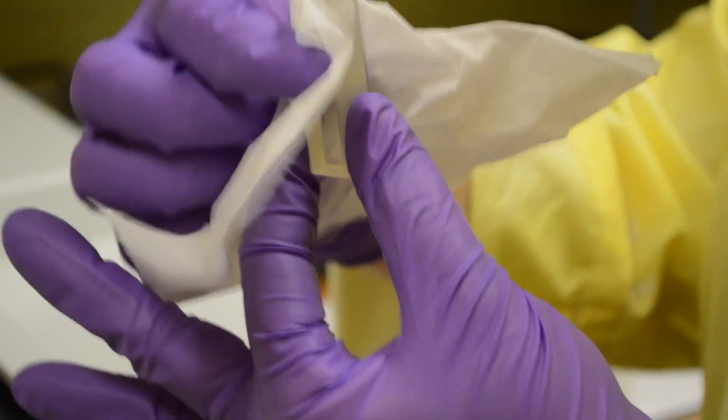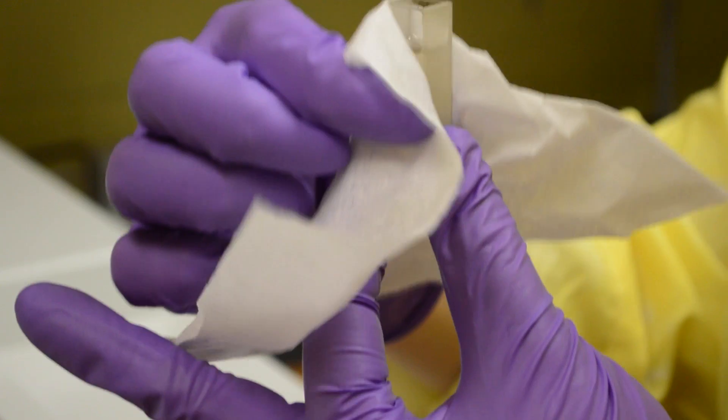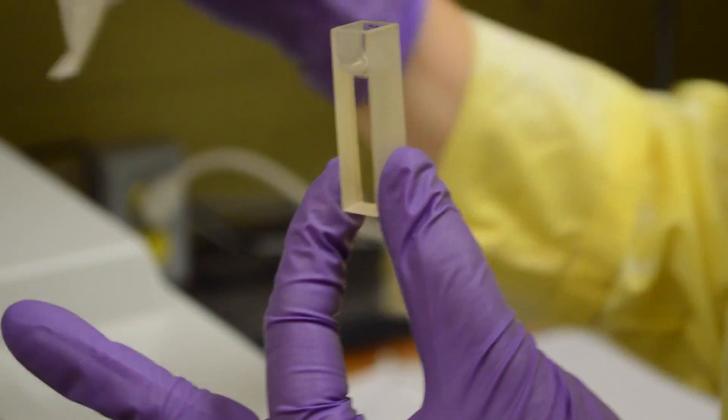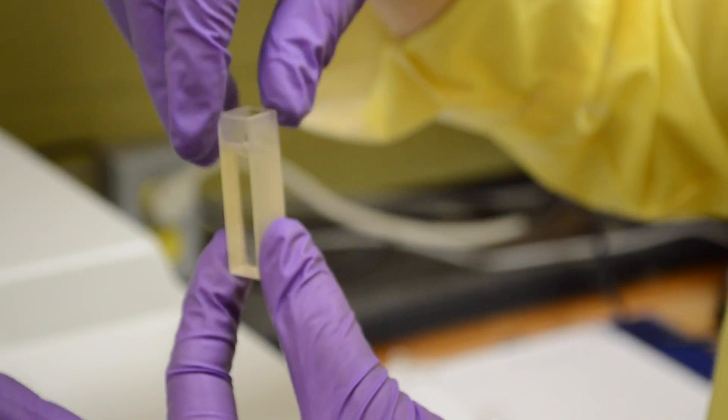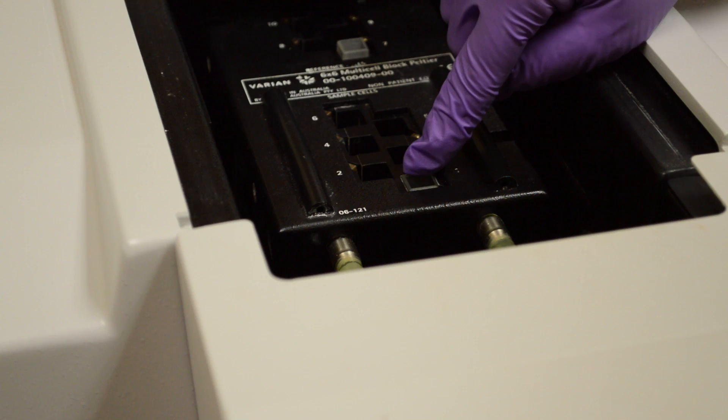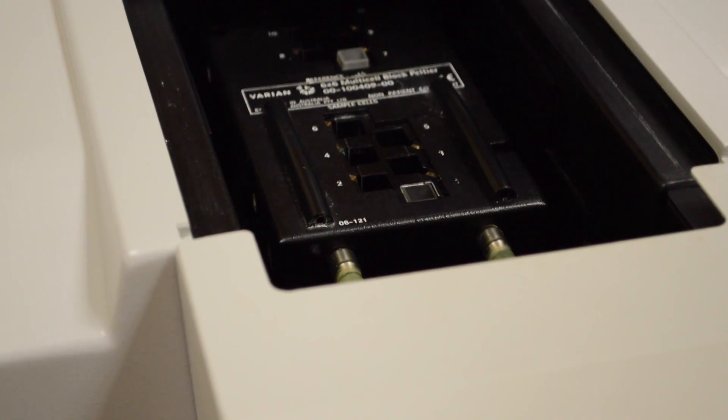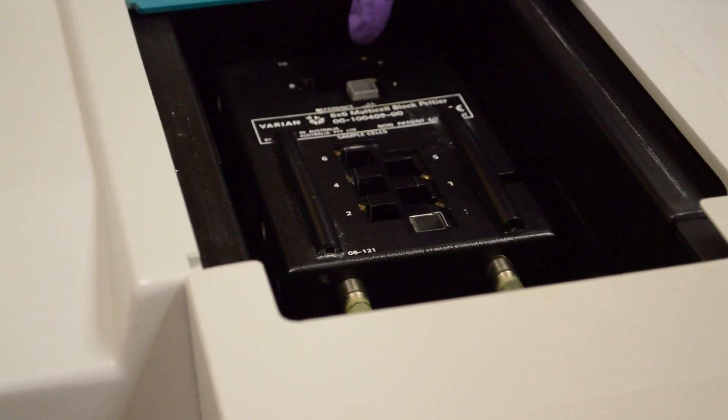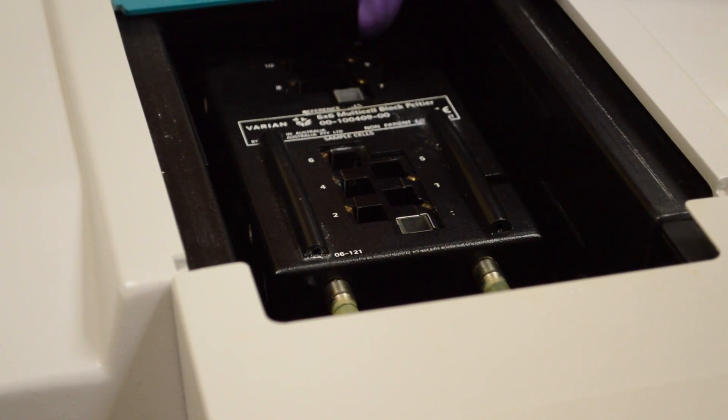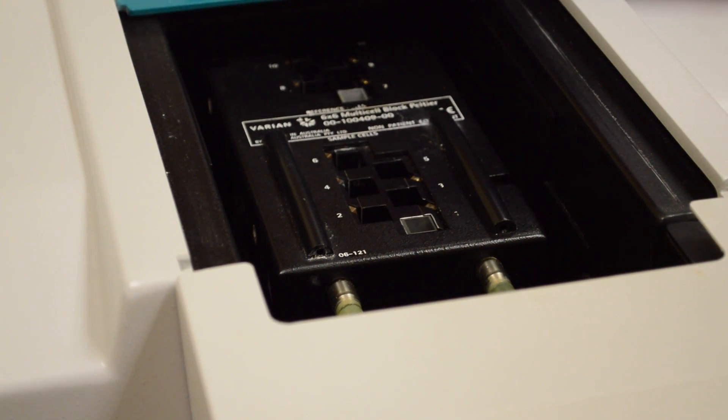To put the sample in, clean the sides with a kim wipe to ensure that there is no residue left on the clear side of the cuvette. You're going to insert the sample into the machine the same way you put the blank in. So once it's pushed down all the way, make sure that the cuvette in number seven is pushed down all the way as well as we lifted it to remove the first cuvette.